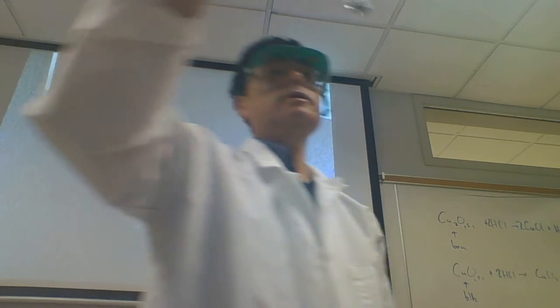It's hard to see, but the solution is starting to turn what color? What color do you predict the solution will start to turn? Well, it's still clear, but give it some time. In a couple of minutes, the solution will start to turn what color? Will it turn the same color as silver? Well, what's in solution at this point? Copper nitrate. Oh, will it turn blue? It's going to turn blue, if it gets concentrated enough. It's kind of hard to see right now.